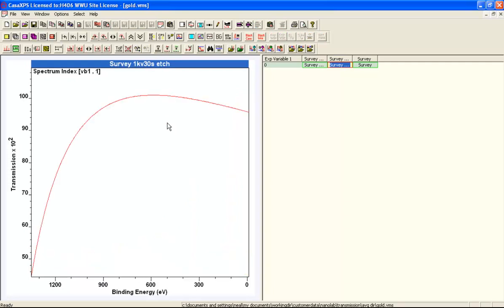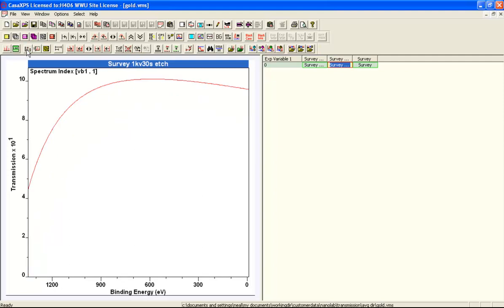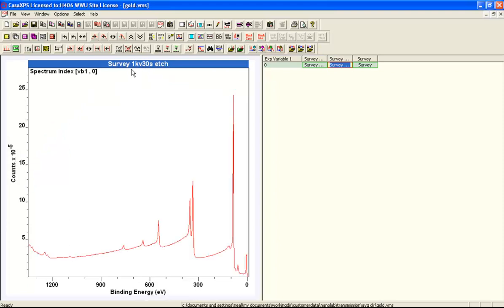The first correction we'll look at is the transmission function, and this is the transmission function that's included in the AVG file. This is the response of the instrument to different kinetic energies.